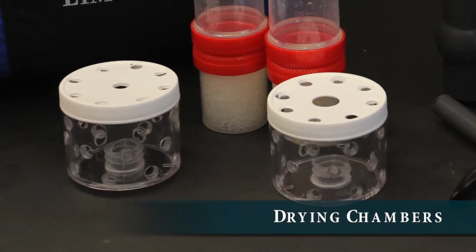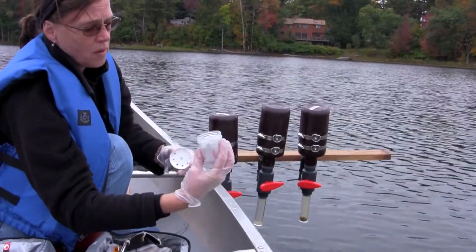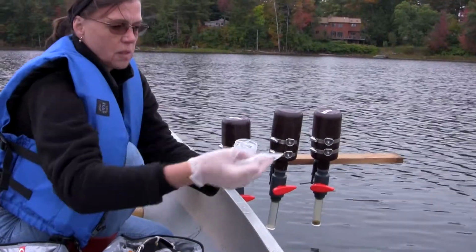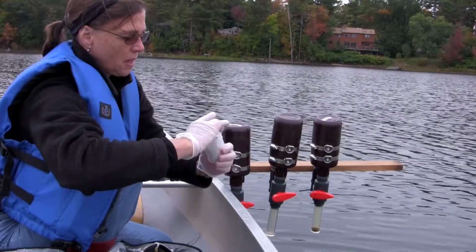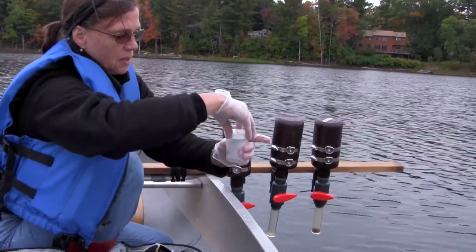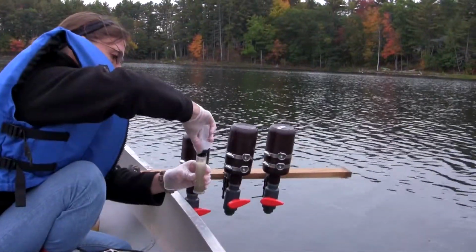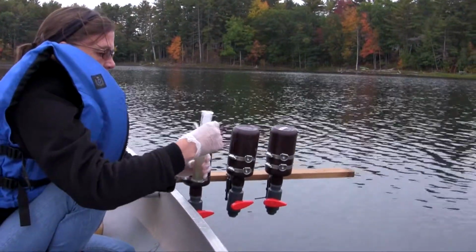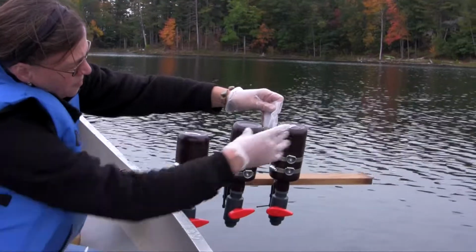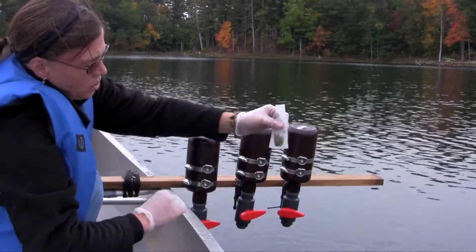The drying chamber is very, very simple and straightforward. We've just put a couple of heat packs in here inside, and we've been letting them sit for 20 minutes now. It's about 110 to 120 degrees inside the drying chamber. And all we have to do is take our filter cone, we place it inside the drying chamber. We'll end up having all 3 filter cones with the zooplankton sample inside this container when we're finished. And now let's get Lake Attitash. We dabbed a little bit of extra water off the sample before we put it into the drying chamber.